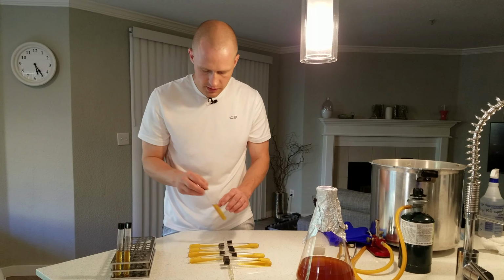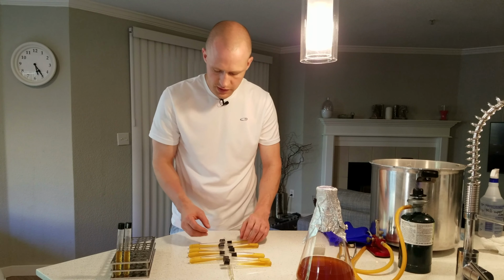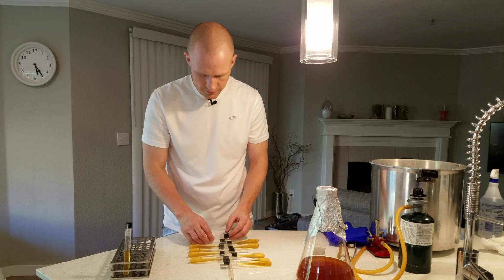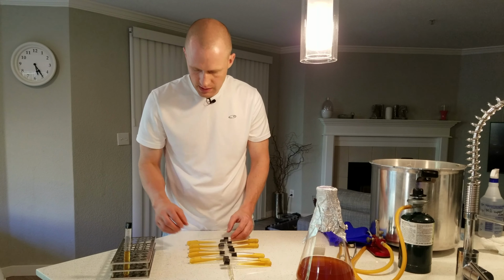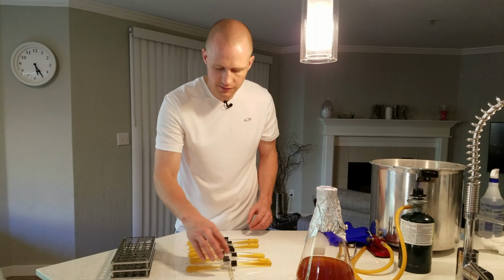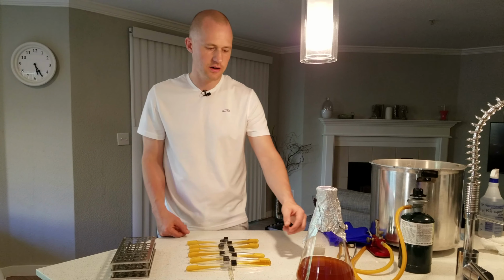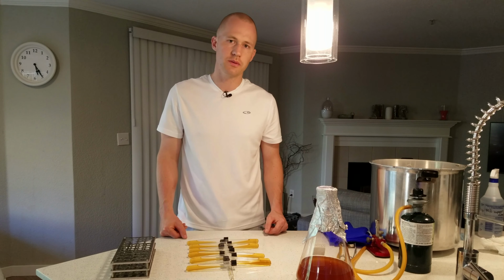Now these are going to lay here and cool down to room temperature. Once they are cool, they will gelatinize, and we can then put them back in the tray and put them into an incubator where they're going to stay for a couple of days just to get rid of any condensation that's inside the tube at this point. We'll be back once the agar mix that's in the Erlenmeyer flask has cooled down enough to where we can pour plates.